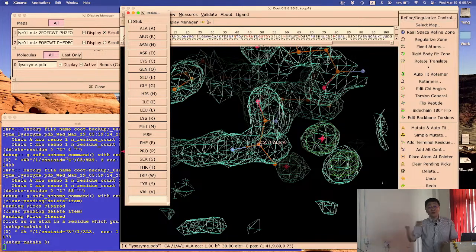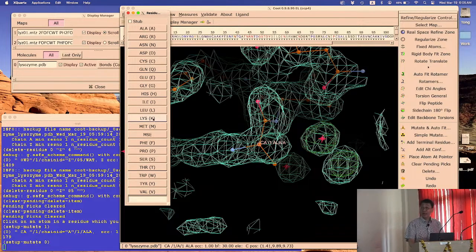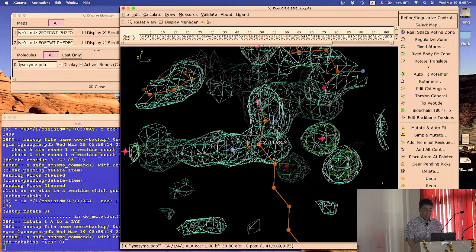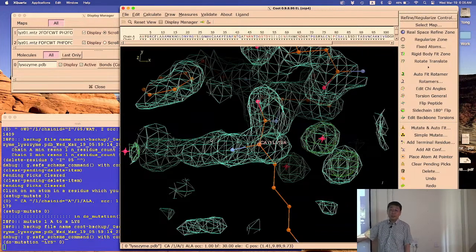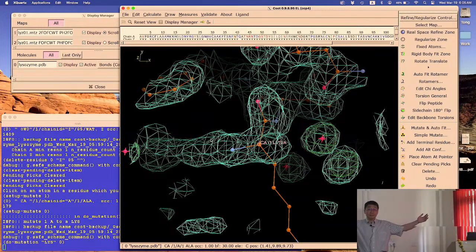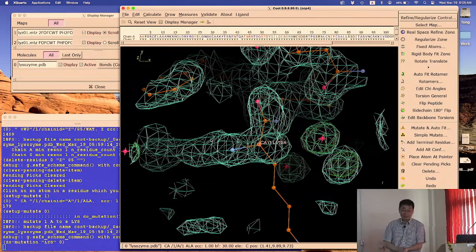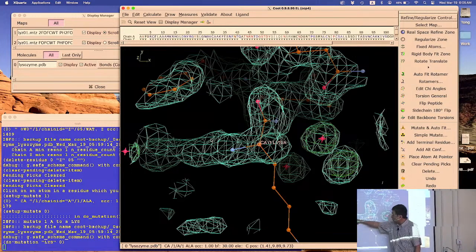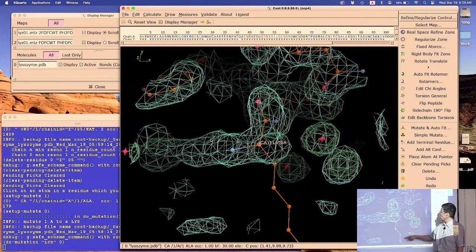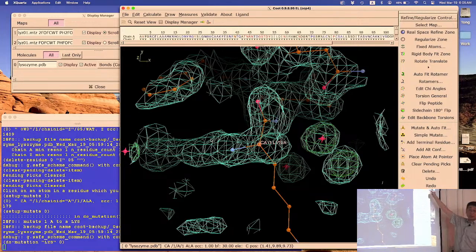Okay. Oh, you're ahead of me. That's okay. So lysine, happy with that? Lysine? Okay. And now you should see the side chain sticking out. See that? Everybody has it? Yes, sir. Good. Now let's do some dragging finally. Okay, so now we need to bring this into the density. Density is here, side chain is here, obviously not happy. So when you do a real space refine zone up there, click on that.